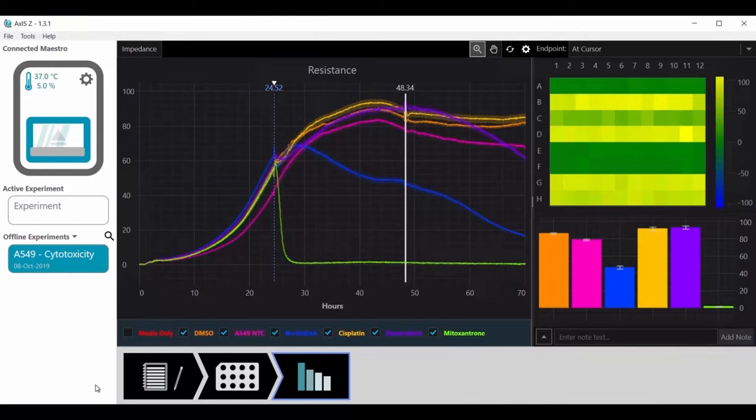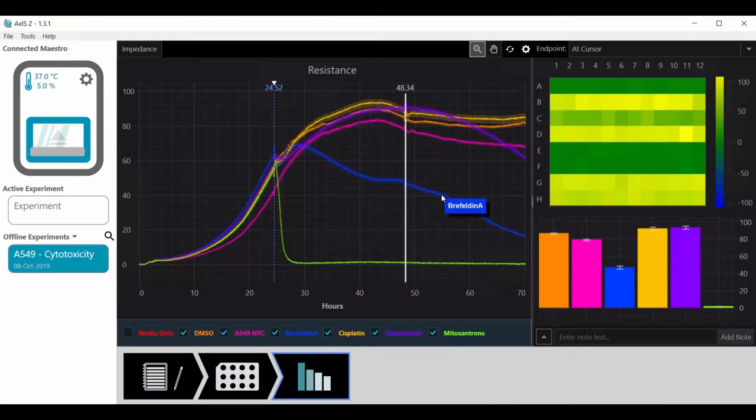With the real-time impedance curves, you can compare the dynamics of cell killing across the various test compounds. Mitoxantrone killed the cells quickly, while Brafelden A and Doxorubicin showed progressively slower killing.